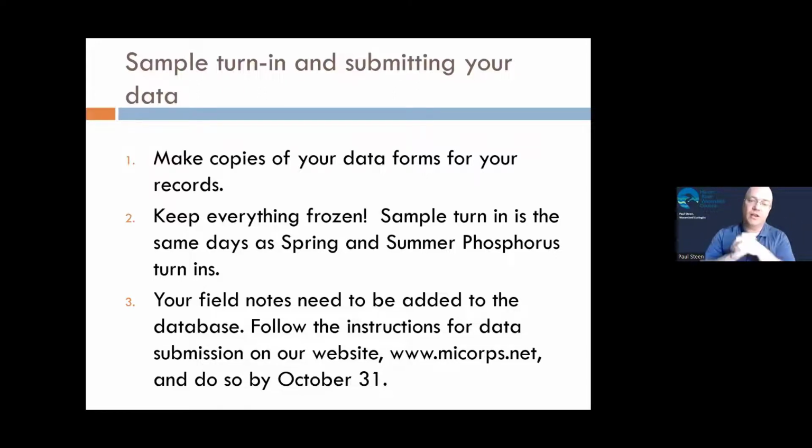Like, first of all, we want copies of your data forms, but electronic copies are fine. But for quality assurance, we like to have that. Keep everything frozen, just like with your phosphorus samples. Your chlorophyll needs to be in the freezer until you bring it in to your drop-off point.